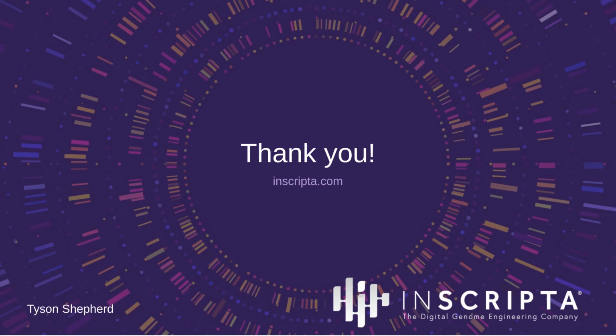Thanks for that question. That's fantastic. So we are keenly interested in other plasmid-based systems, such as editing on BACs. So I would say reach out to an account executive if you'd like to chat about that. The plasmid-based system that was used here is a higher copy plasmid-based expression system, but definitely we have ongoing interest as well in BAC-based systems.